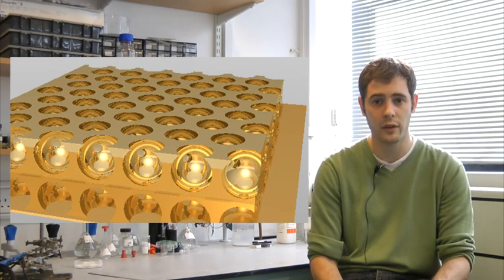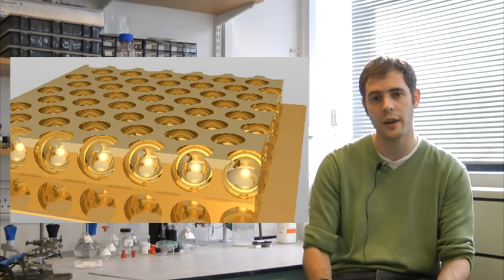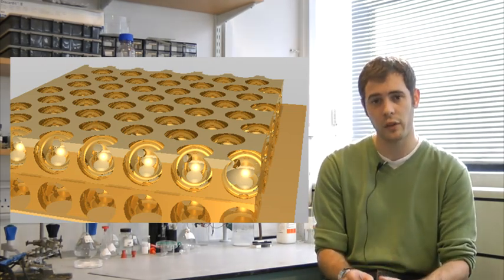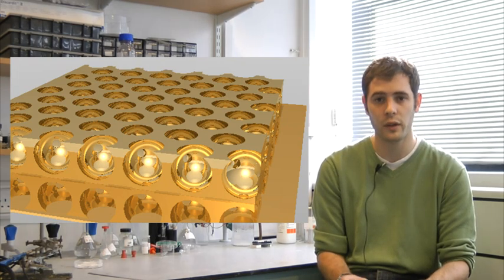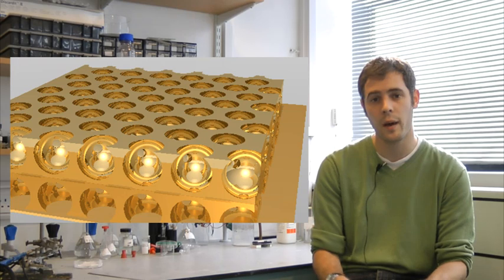We then dissolve the spheres away using solvent, and we're left with just this perfect template of a kind of honeycomb structure of gold. The honeycombs, the actual sphere voids inside the gold, are the same size as the wavelength of light, which means when we shine the light into it, it creates these plasmons, and we can use those for SERS.